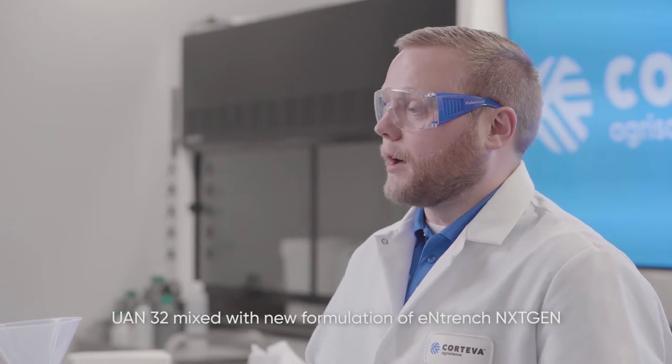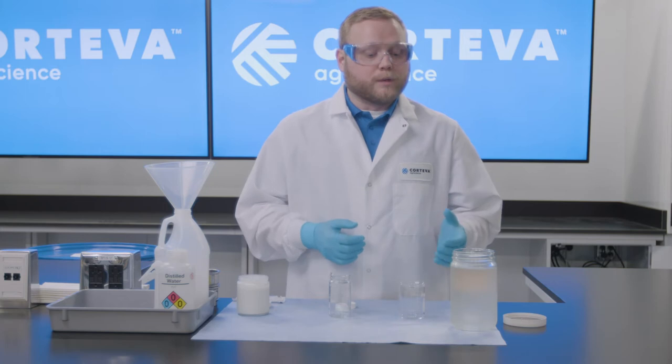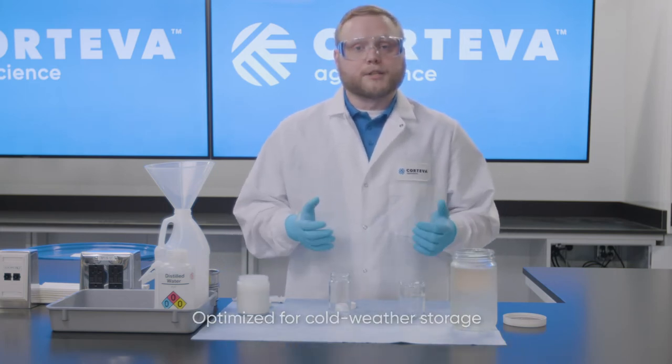For this first blend we're going to look at UAN 32. We know that our products are used in early spring and late fall applications, so what we've done is chilled both the fertilizer and the product down to five degrees Celsius for this mixing.